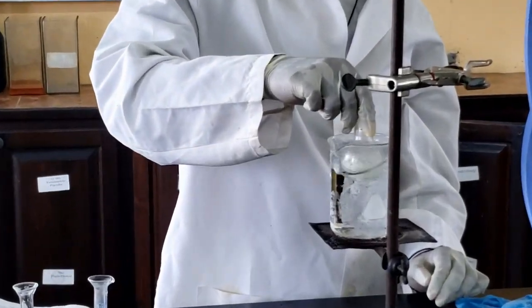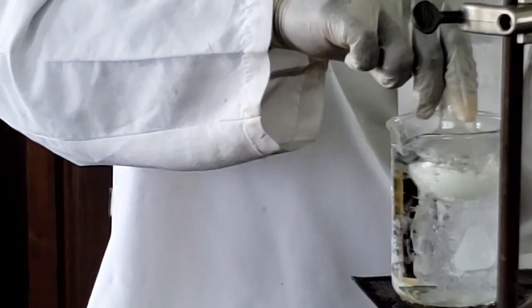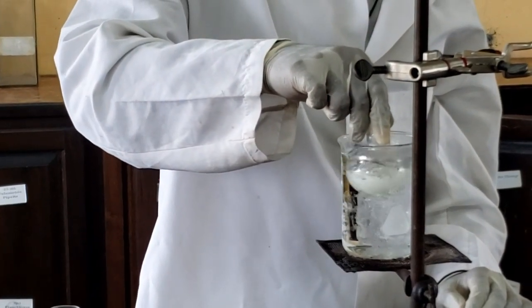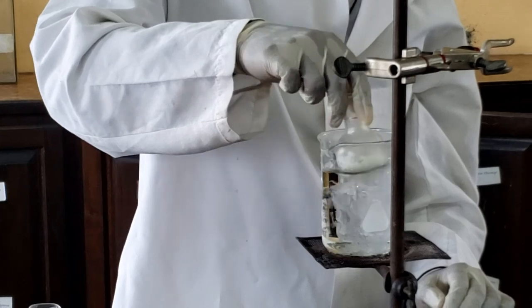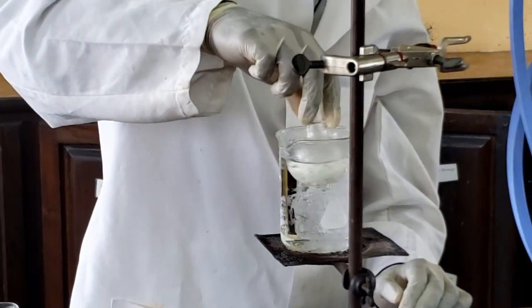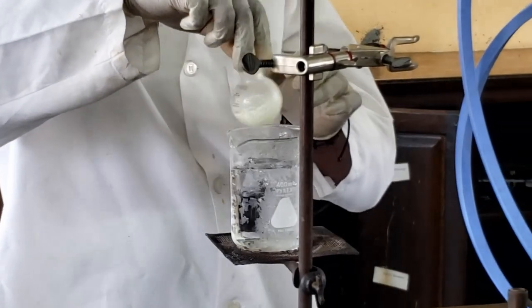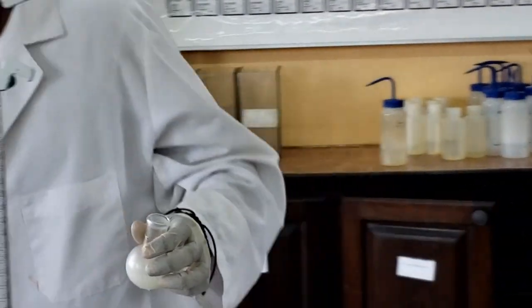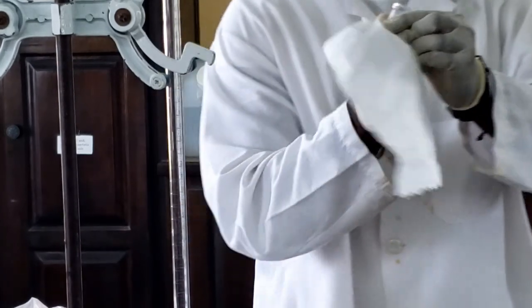Okay, so we've reached about that 10 minute mark. I've completely added all the bromobenzene. As we continue cooling, if you look here, you can see some of the product is already crystallizing.